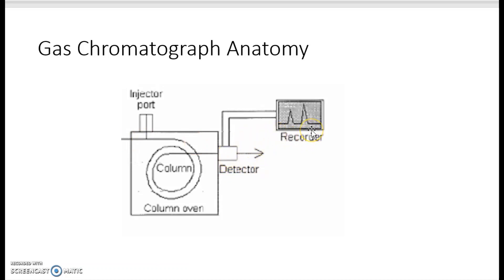The detector turns the signal into peaks that LoggerPro can read and record. So what you want to be thinking about is: why did these very similar compounds have different retention times? Why did it take longer for n-butanol to move through the same column, same distance, same material inside the column, than it did for n-propanol?